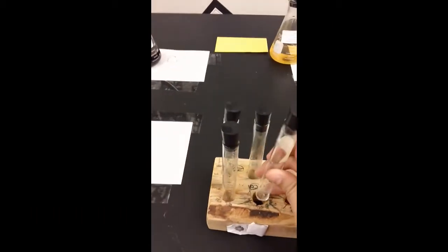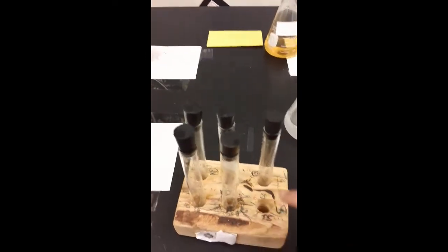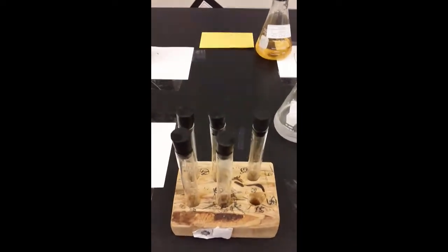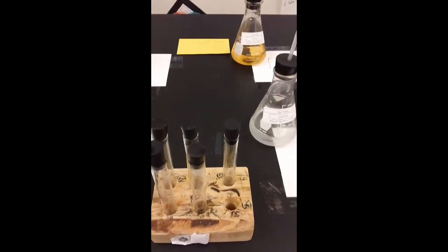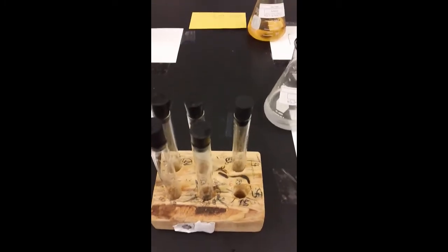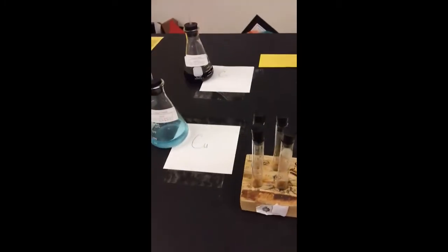So what I'm going to do is I'm going to put 1 milliliter of each of these knowns into my test tubes, which should be clean, and I want to make sure that I label which test tube is which one, so that when I go out to my tests and I make my observations, I can be really accurate with which observation goes with which chemical. So I'm going to do that one now.